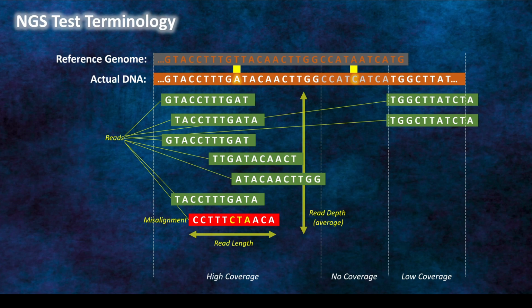You'll get some areas with much more than that, and some areas with much less, and some areas with no coverage at all. So this is just a representative example that's been shortened down a bit. The read length typically, for what's called short read next generation testing, is usually between about 100 or 150 base pairs. It actually doesn't vary that much because you're reading that much of the fragment, trying to read it repeatedly. In this example, I've obviously shortened it down quite a bit too.